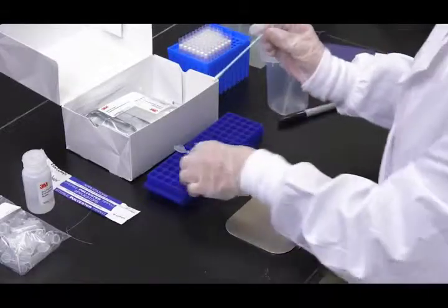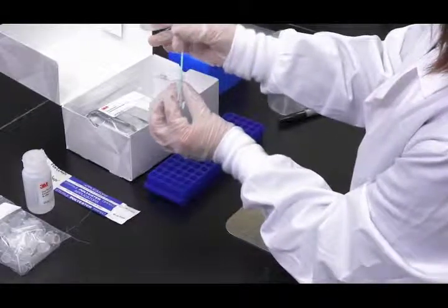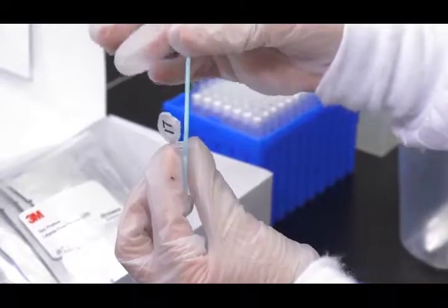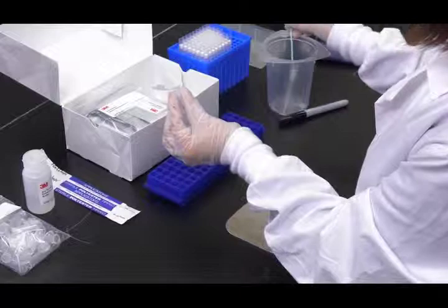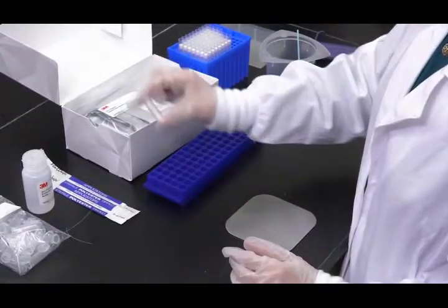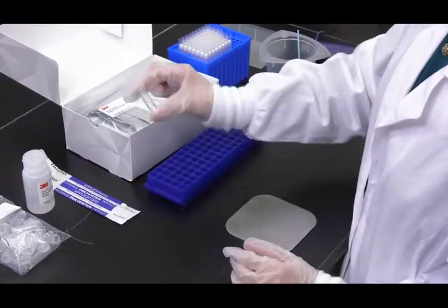Next, take the swab, insert it back into the pre-labeled tube, and swirl it several times to release any residues from its surface into the 3M extraction buffer. Break off the swab tip in the tube and cap it tightly. Shake vigorously or vortex for 15 seconds to mix thoroughly and obtain an extracted sample.